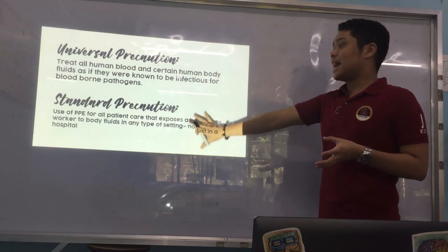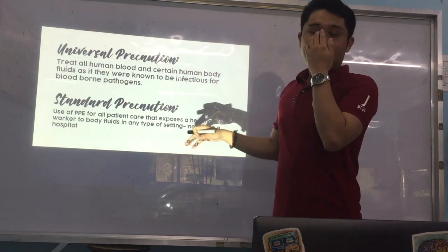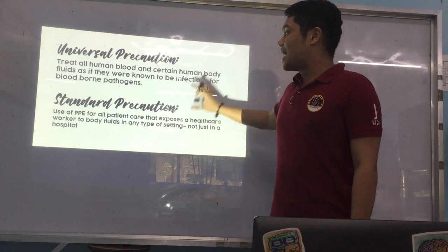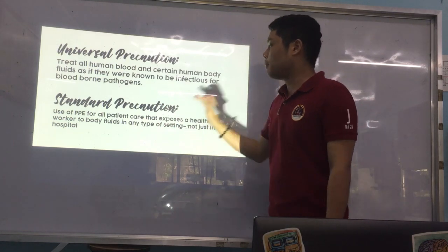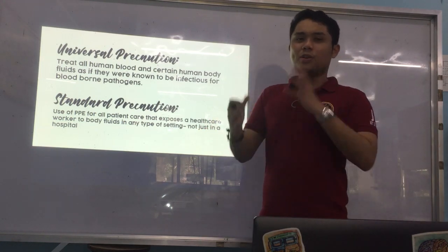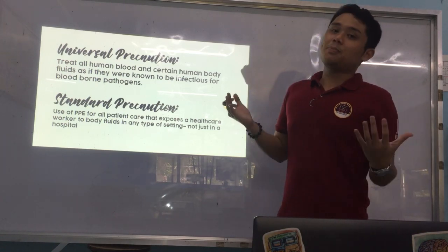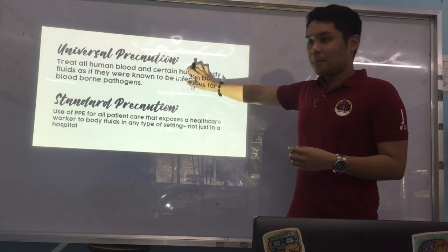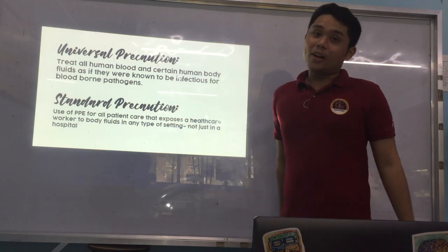What is the difference between universal precautions and standard precautions? For universal precautions, as you may have noticed, it's not stipulated that you should wear PPE. For standard precautions, it adapts that same statement but now including PPE — you should use PPE for all patient care that exposes a healthcare worker to body fluids in any type of setting. What laboratories follow is usually the standard precautions.